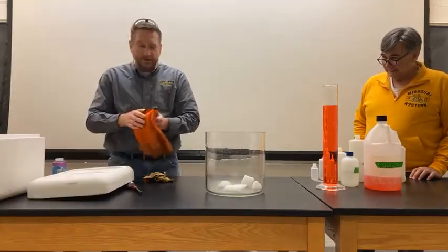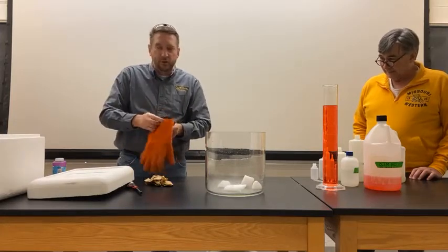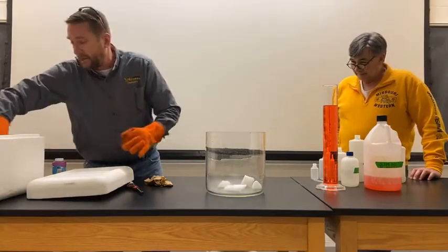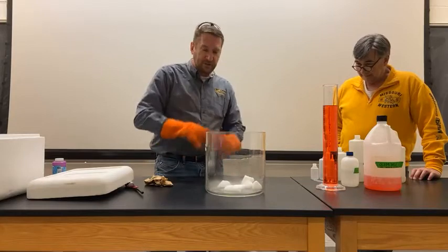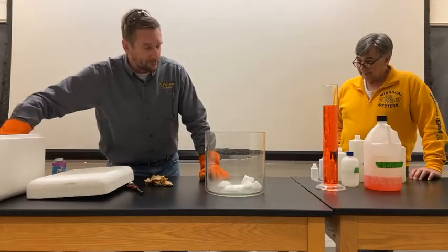Now one thing, you can of course buy dry ice at most grocery stores, but you want to be very careful when you use it because it's extremely cold. And so I'm wearing gloves to protect my fingers because I don't want to end up with any frostbite on my fingers.